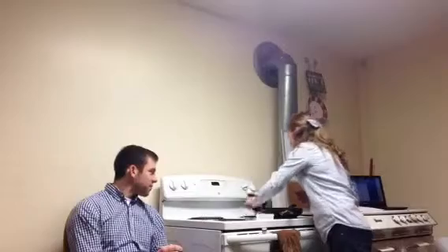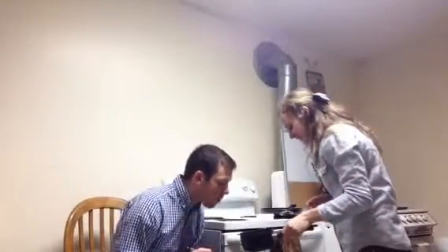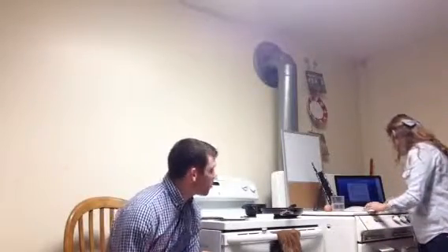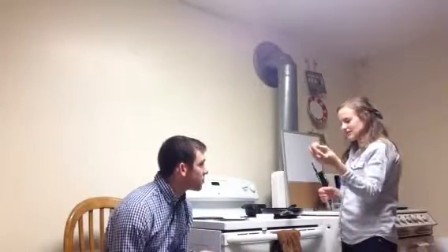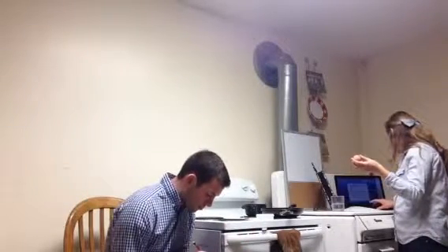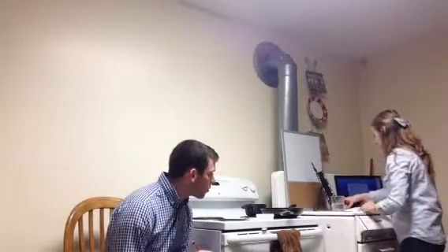Yep, and then steam. So, as you can see, it's already starting to melt a little bit. We're going to keep that on for just another minute or so and see what happens with that. Let's move on to example 2 while we're waiting. Okay, so I have this. I want you to go ahead and write down, describe what this is. It's an egg. Oh, I'm sorry. We're going to come back to this example in just a minute. We'll set that down.